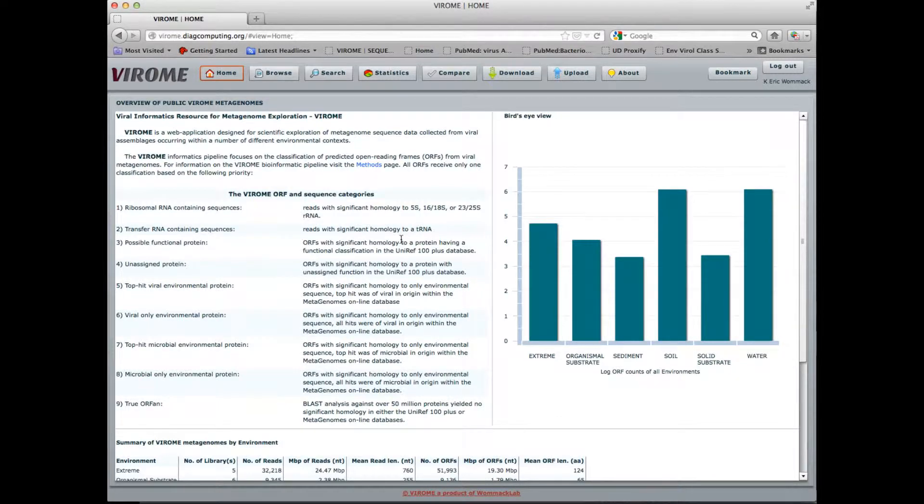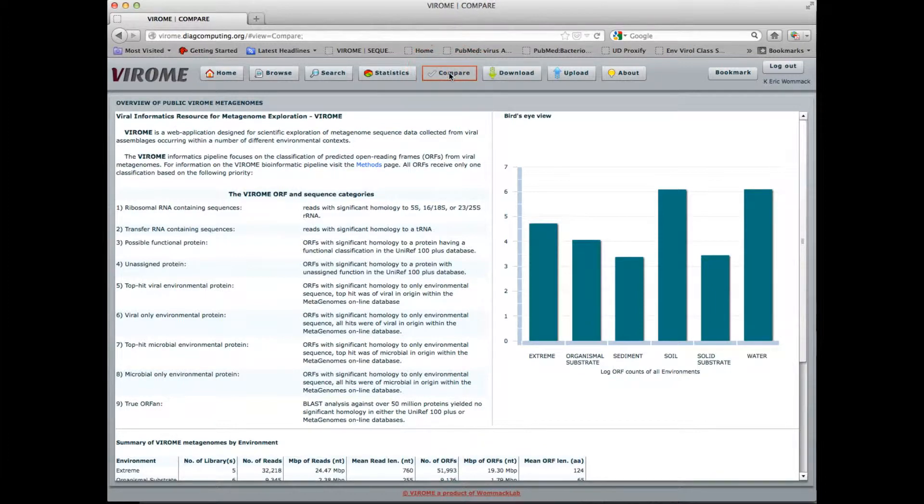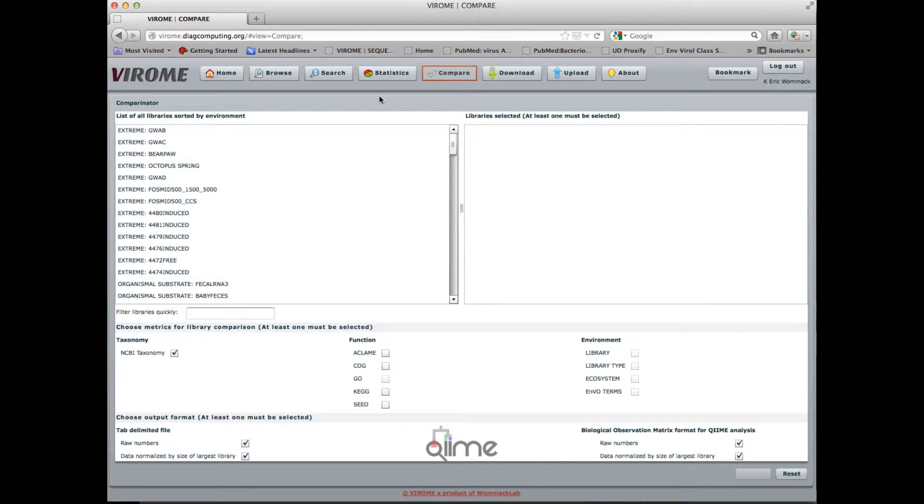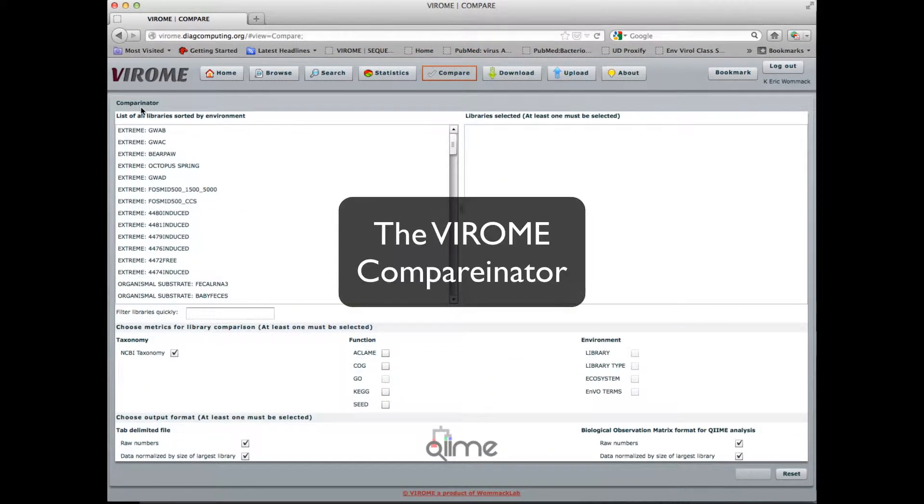Here I demonstrate the use of Viroome for comparing viral metagenome libraries analyzed with the Viroome pipeline. First I click the compare button on the menu bar, and this takes me to the Viroome Comparinator.